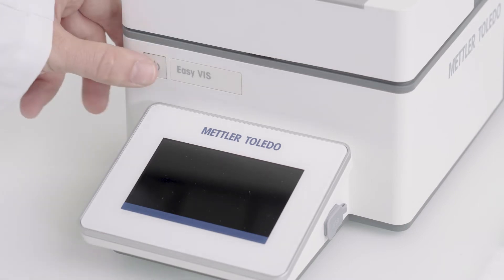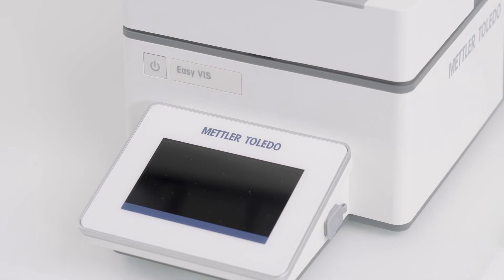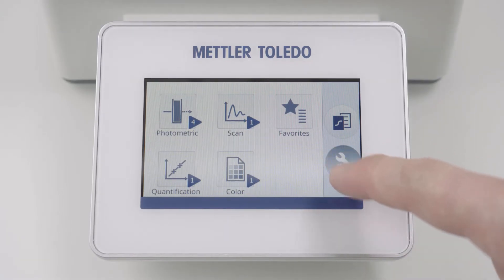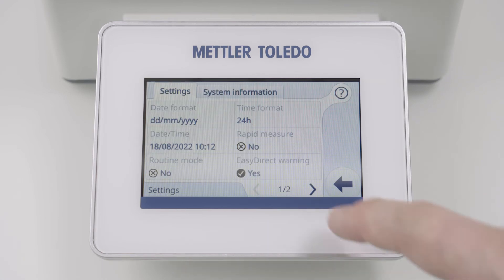Switch on the instrument. After initialization, go to Setup and Tools and reset the lamp counter by clicking Lamp Reset.